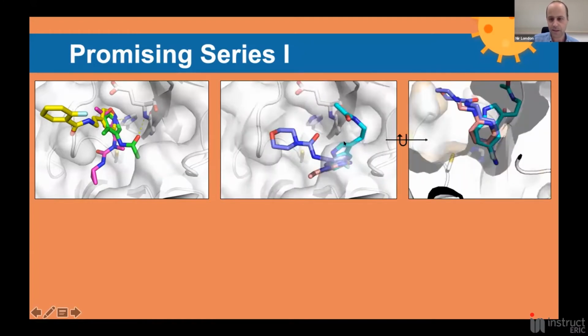A second set of fragments, here's the histidine, the glutamate, bound a little bit further away, all of them putting an aromatic ring with some extension, a cyano or a fluoro or a chloro, that you can see here sort of open their own sub-pockets. So in tan, you can see the surface of these fragments, and in white, you can see that a new sub-pocket emerges by these compounds. This is exactly the structure information that fragment screens allow us to make.